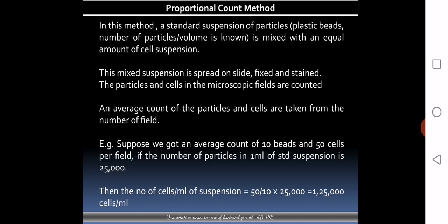This is a comparatively simple way to count the bacterial cells in a liquid solution, and this will usually give a total count again. There is no differentiation of viable count and total count, only the total count will be given.